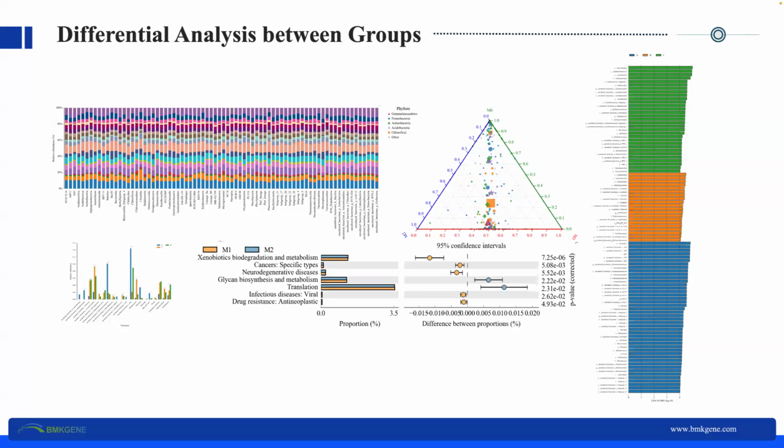Notice that statistical analysis methods are complex and diverse. They have different principles and applications. Please select the analysis method and the results that can best explain the biological phenomena according to your actual needs.